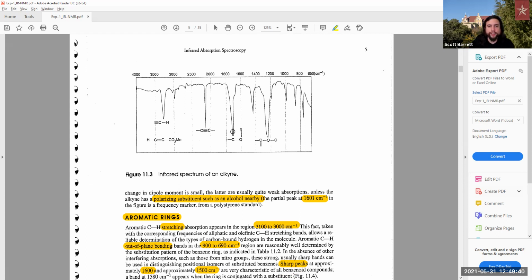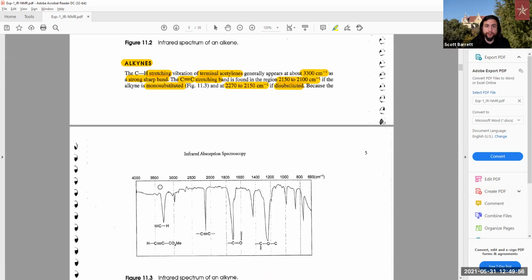And this is sort of an example here. It's not a very good example because this is more so showing a carbonyl. But I would be more focused on the specifics with the alkynes, very far past 3000, like 3200, 3300 over here. And then also the possible stretching band in the 2000s region.